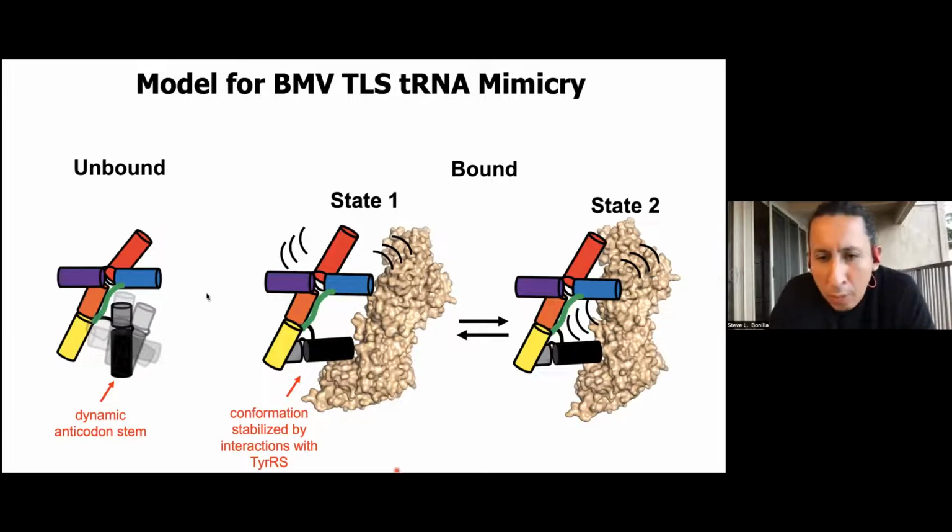I think there's probably a lot more room for improvement. The preferred orientations were definitely one of the issues, which I showed. There's also the variability that we saw, right? I showed that there were multiple bound states, and there's also a combinatorial thing, because the enzyme binds two different RNA molecules, and we believe those two RNA molecules can be in different states, right? So you can have multiple combinations of them. Maybe collecting more data and doing much more stringent classification could potentially lead to higher resolution.